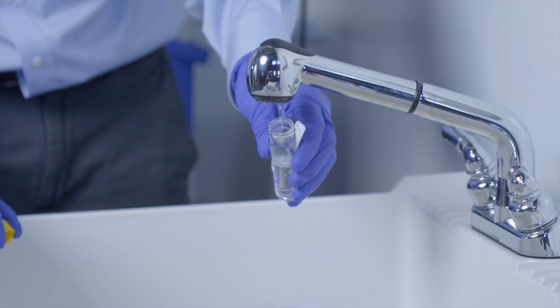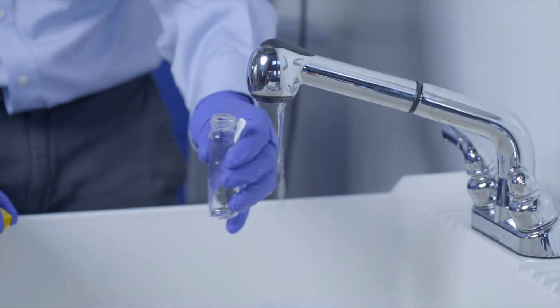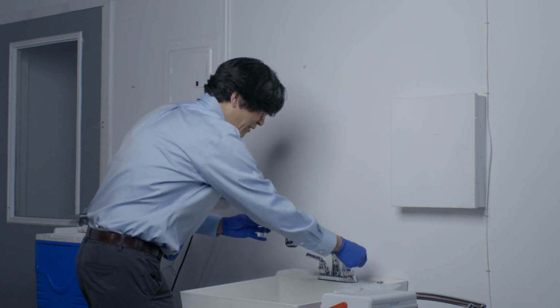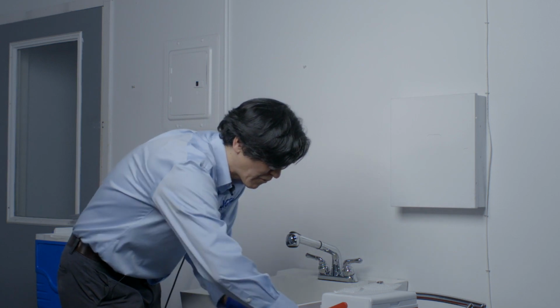We're going to fill it up till it has a little bit of a dome on top. So there we go, we have a little bit of dome. We're trying not to overfill this bottle, okay? We've taken our sample. I'm going to turn off the water. Here we go, we're going to set this down. It has a little dome.